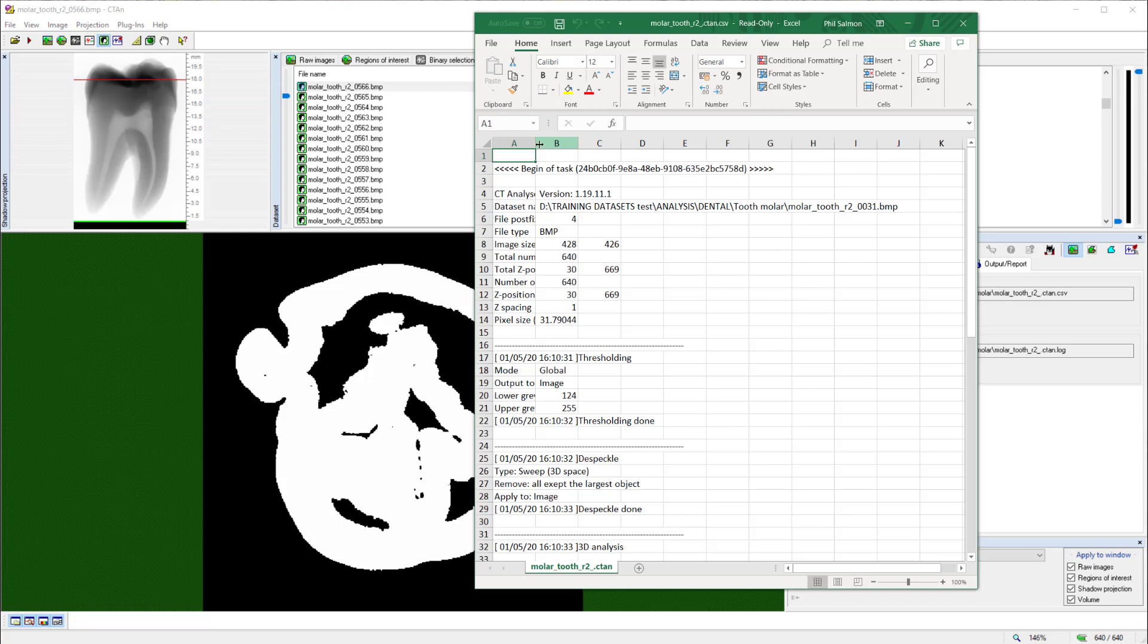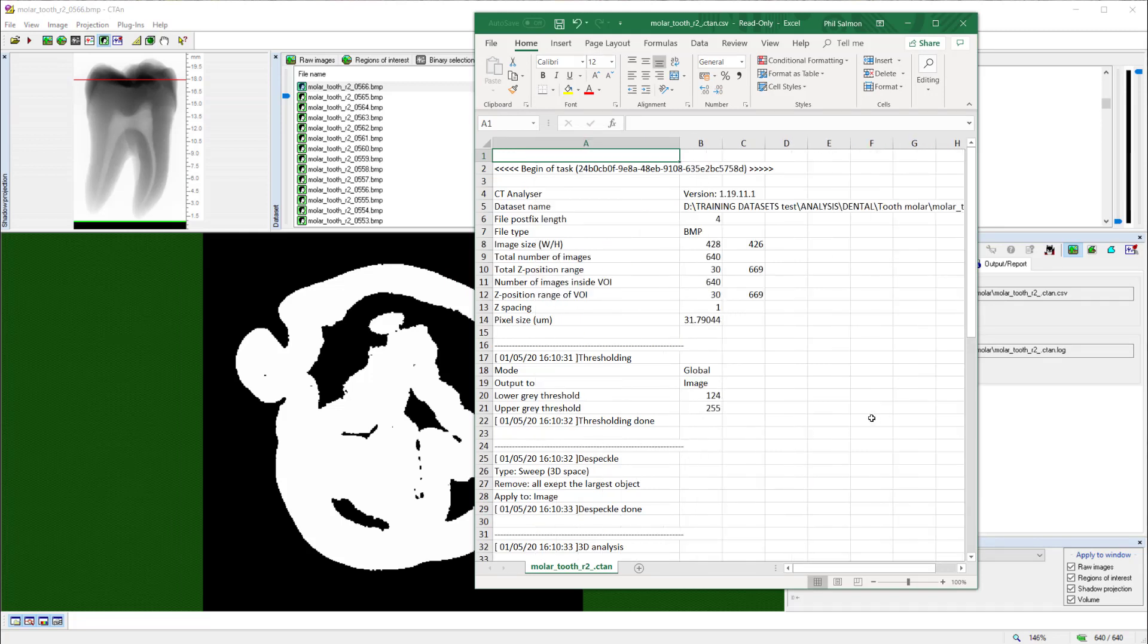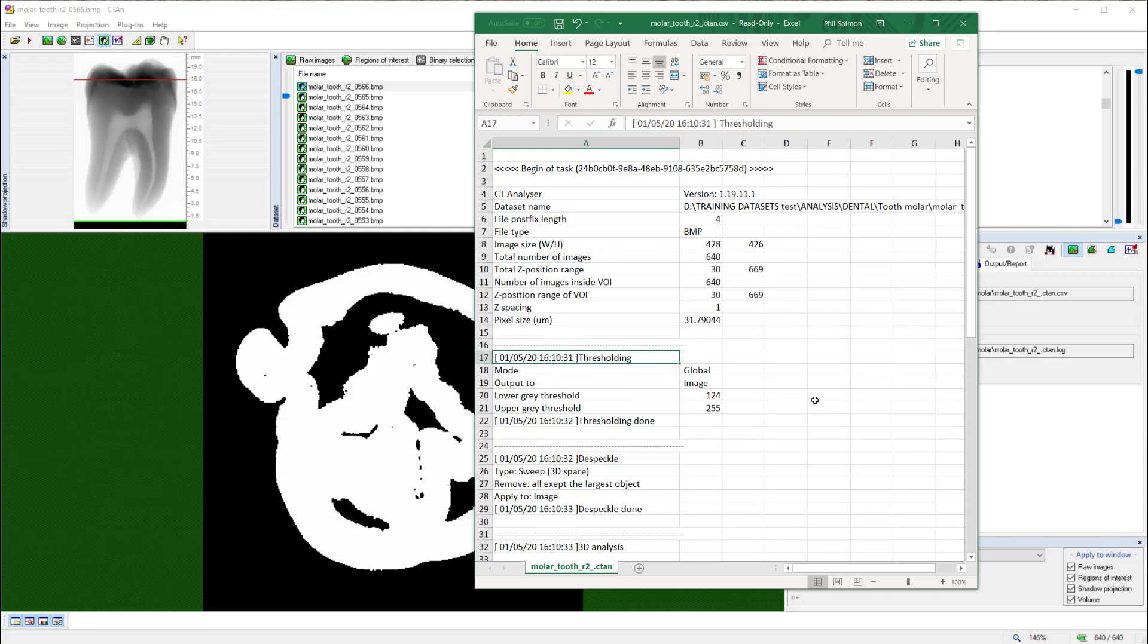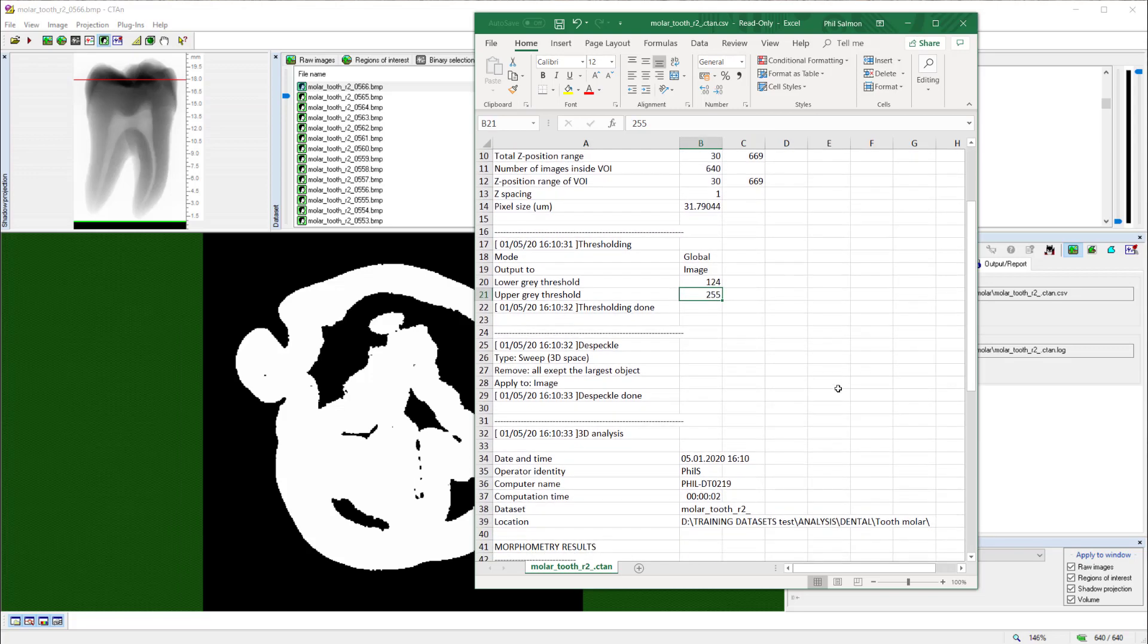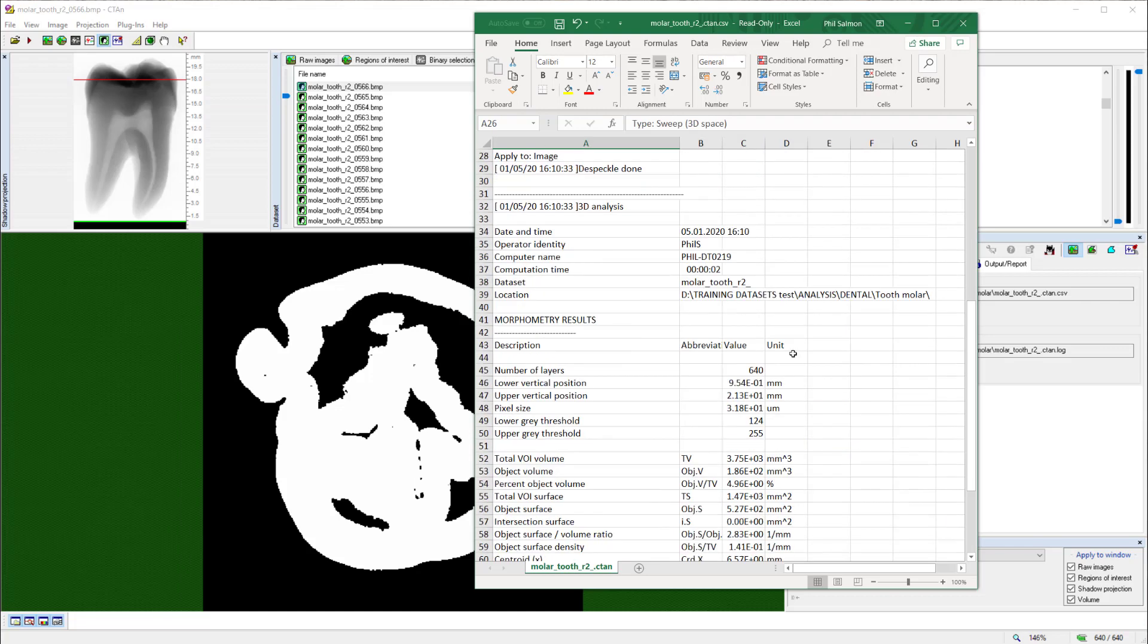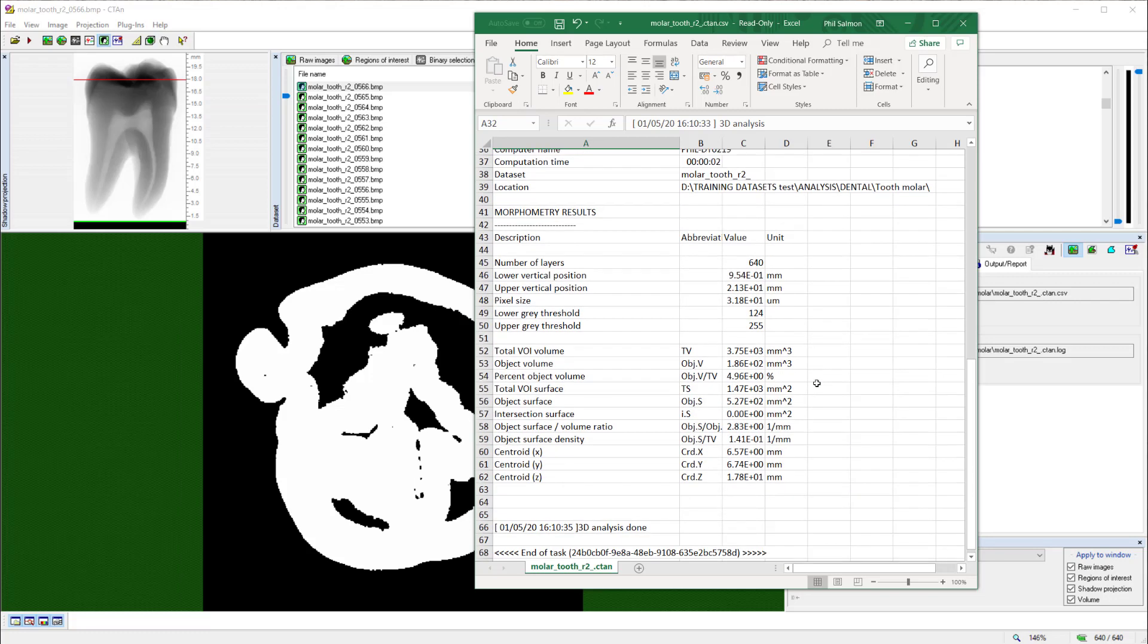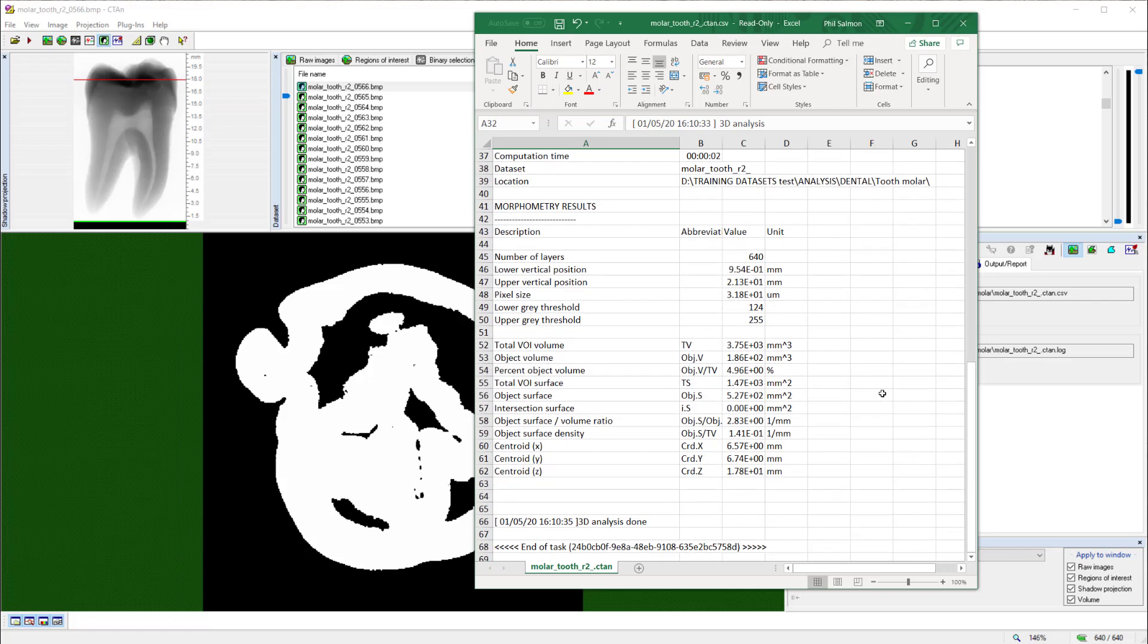And the results can be viewed again by clicking on the output report page and the open button. So now we can see what happened in our task list. Here are the details of the dataset that we analyzed. Our first operation was thresholding, 124 to 255. Our second operation was to sweep in 3D space. And our third operation was the 3D analysis. And here are the results of that 3D analysis, showing once again the volume of the enamel to be 186 millimeters cubed.